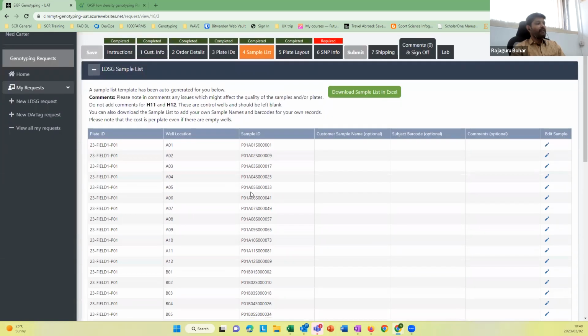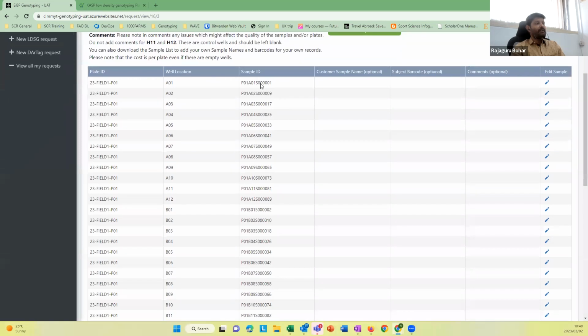So when you combine the unique order ID with your sample ID, that's going to be your unique ID across the job as well. We discussed this while developing the system. Nick or Ing, if you want to add something on that, feel free.